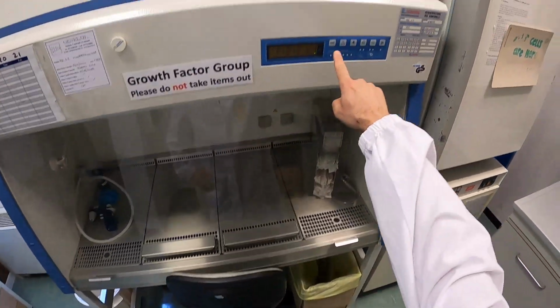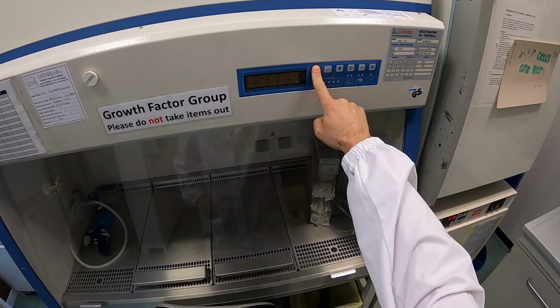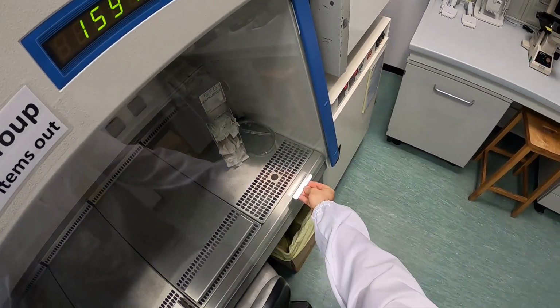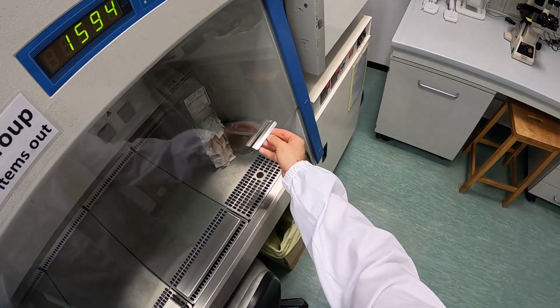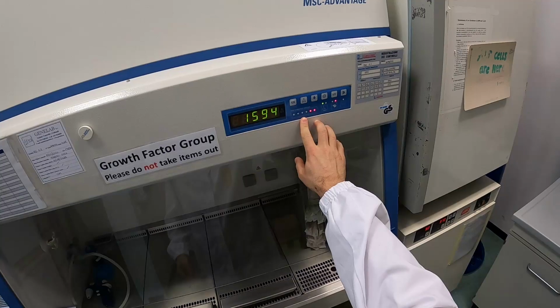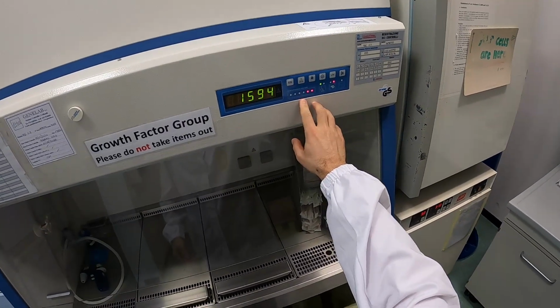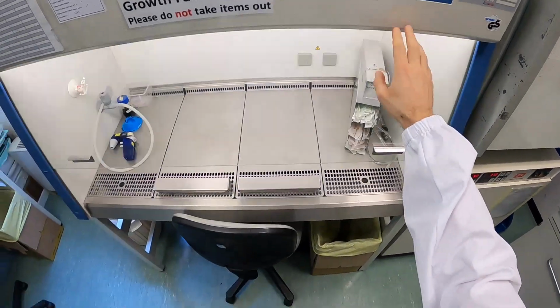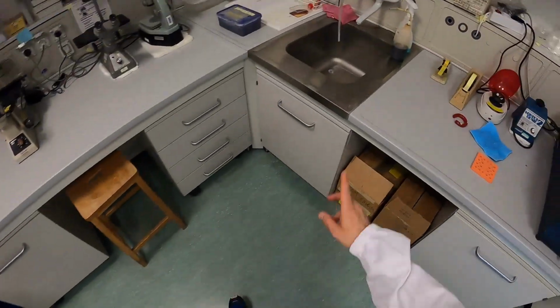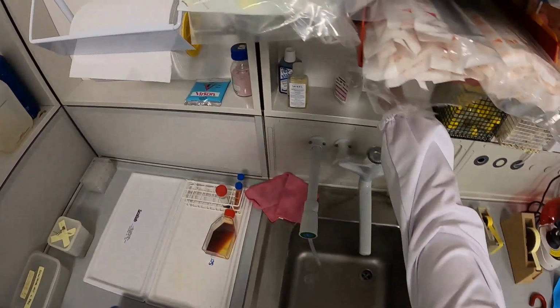So, we have arrived in our tissue culture room. Let's start by switching on the flow cabinet. We switch on the fans and you're lifting the glass to a level indicated on the side. Switch on the light. And then let's do one of the most important things first.